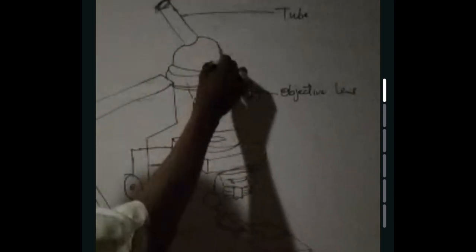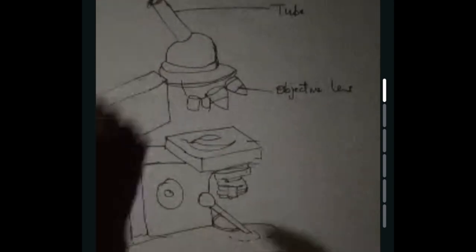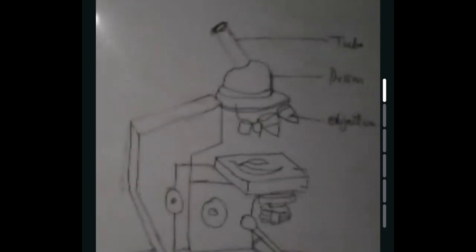So this is called the objective lens. I can label a few parts of it. I can't waste my time too much. So this is the objective lens. I think this is the prism. As we are doing it together now, I'm not rushing. This is the prism. This is the tube. This is the objective lens. It would have been better if I'm asking people. Okay, I know what this is. And after this, I'll be telling people to tell me the answer.